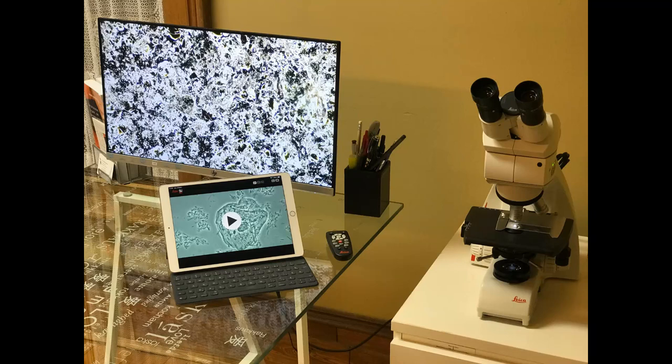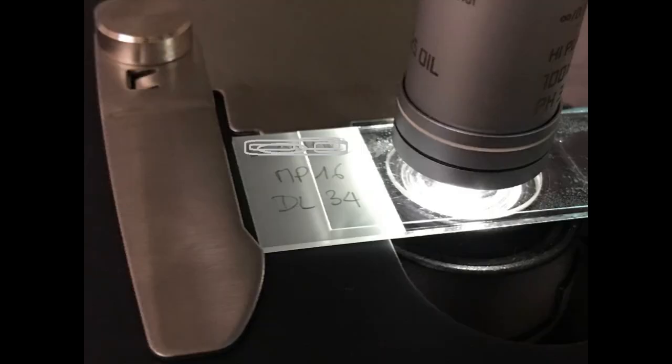Hi, Dr. Bonner speaking. Here is our usual setup in the clinic. So we have this Leica microscope, which is Wi-Fi, and we have a television screen and iPad, and then we have this biofilm from a patient at 1000 magnification on oil.